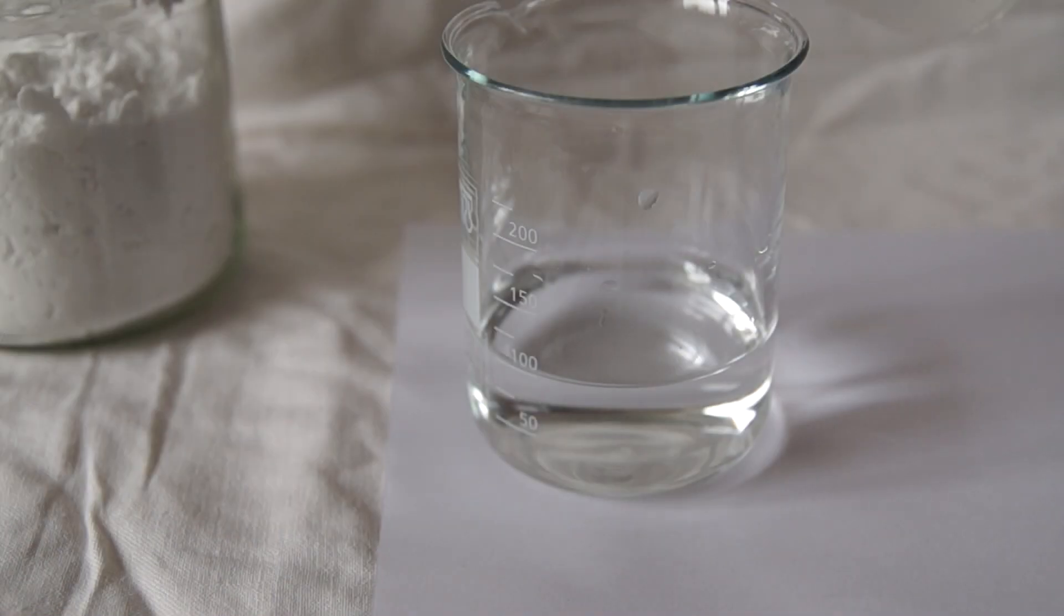Next, pour starch solution to the first solution, where we have a mixture of potassium iodide and sodium thiosulfate.